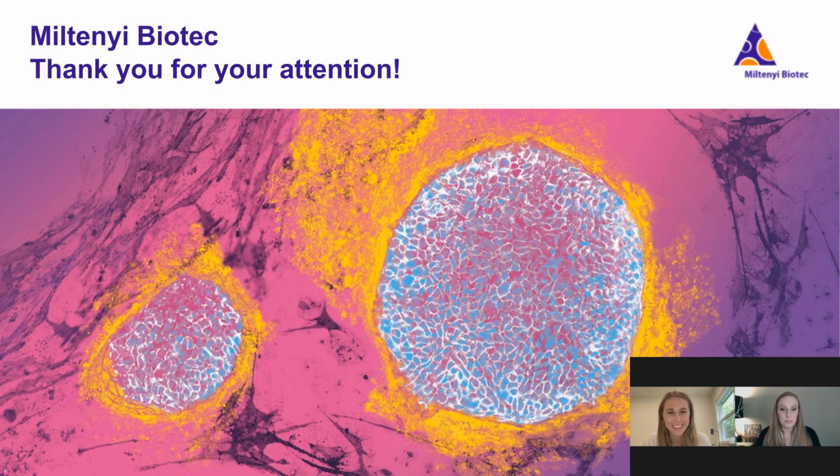That's awesome. Thank you for that. All right, we're going to wrap with this last question. What type of clearing methods can be used with the Blaze?